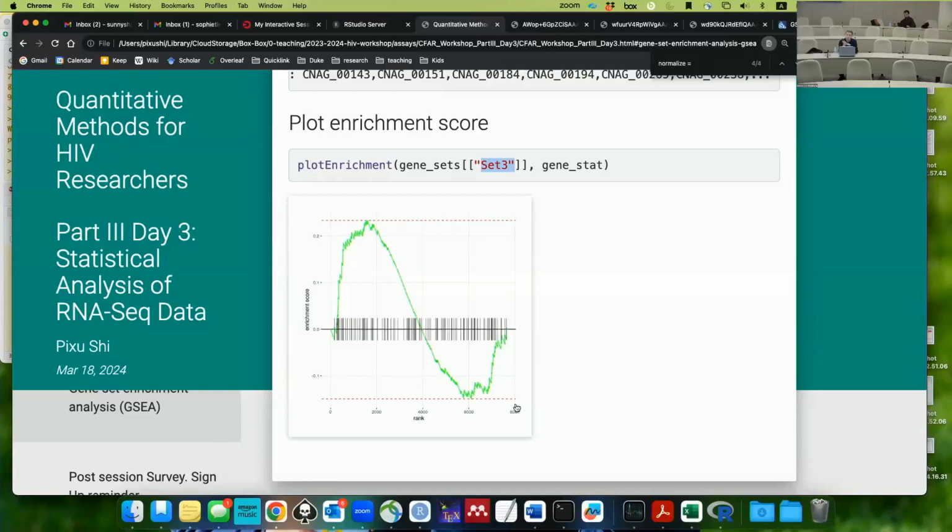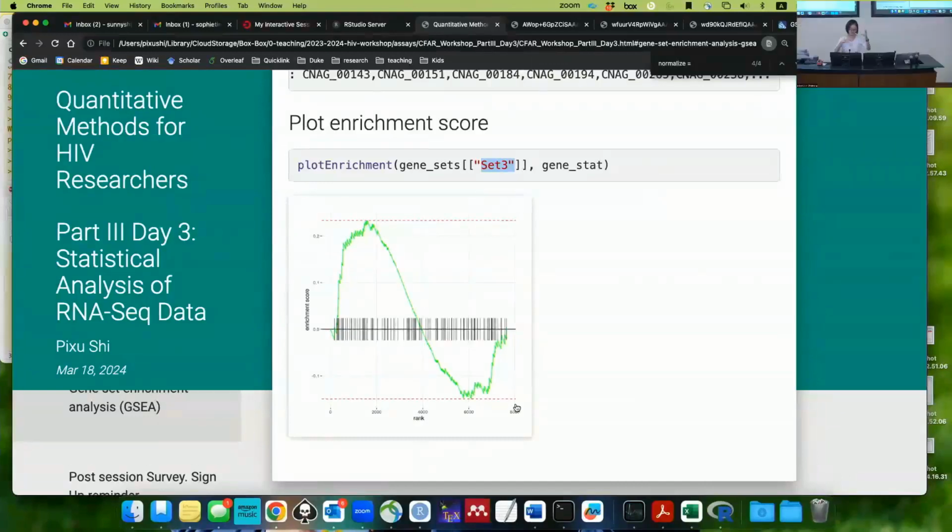This one already does the gene permutation. This one permutes the genes, yes. Okay. It's like the one that you mentioned that shuffles the gene labels, the phenotype labels. That one is more, I would say, more solid, but it's just slower and needs more sample size. Yeah.